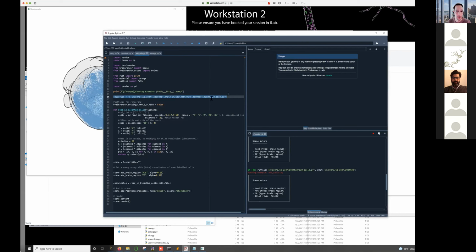A few silly mistakes end up causing me some trouble when I'm doing this. Just check your spelling. It's usually just one little typo that's causing a problem for you. Make sure that what you're calling this variable is exactly what you're calling it down here. Make sure you copied the path and have the double backslashes for everything. Another important thing with Python: spacing is really important. If you have a little bit of the wrong spacing like that, then this function won't run. So make sure that all your lines here are exactly one tab in. So that's important. Yeah, great.